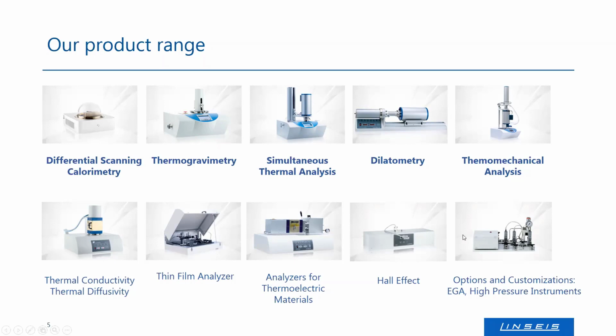So when I'm speaking about the possibility of adding water vapor or humidity generators, I'm speaking about the devices you can see in the upper row here, just for you to know that. Now back to our topic.